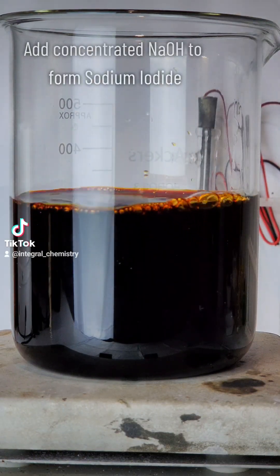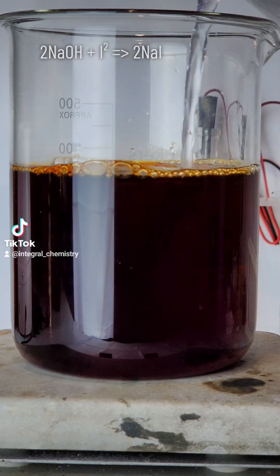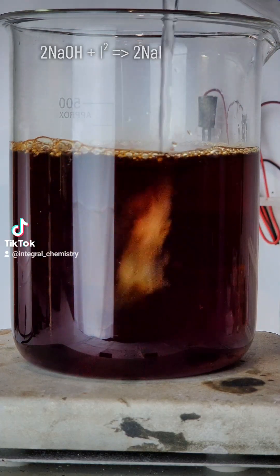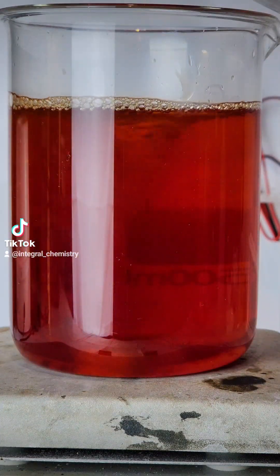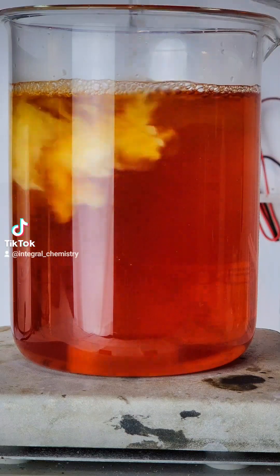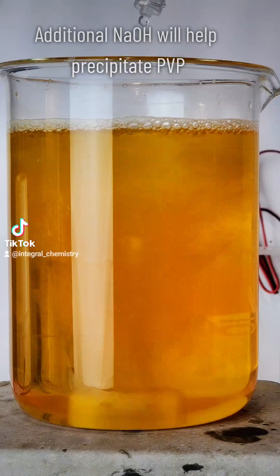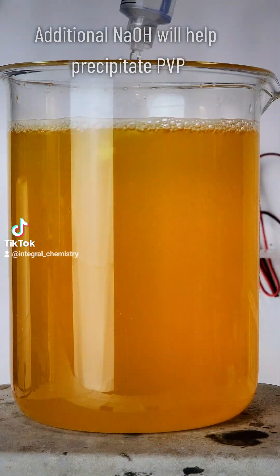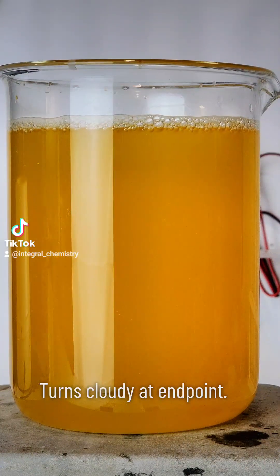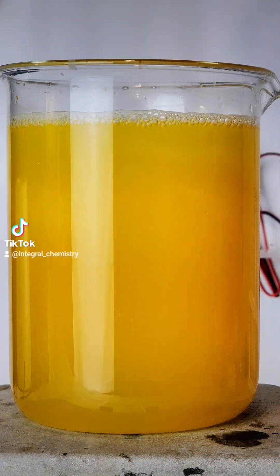To extract my iodine, the first thing I want to do is add a concentrated solution of sodium hydroxide. This is going to break the bond between iodine and povidone and produce sodium iodide, which is colorless and soluble in water. When the solution is clear, it means all of the iodine is broken away from the povidone, but I want to continue adding hydroxide until the solution becomes cloudy in order to precipitate the povidone itself for full separation.